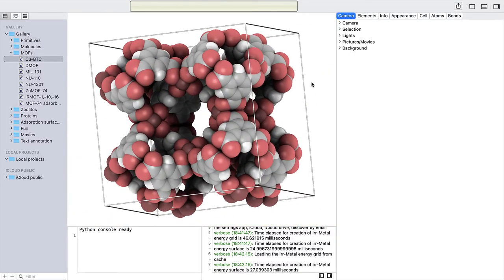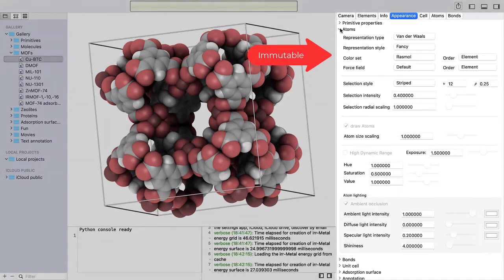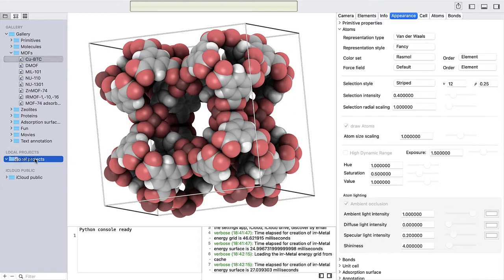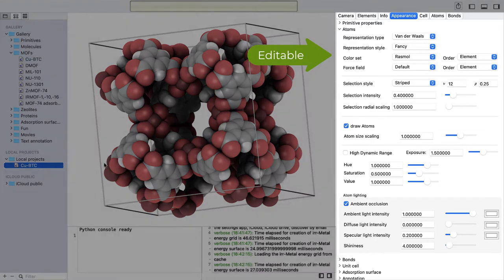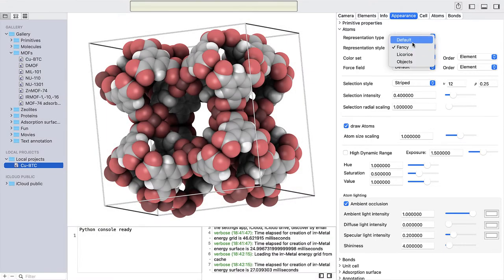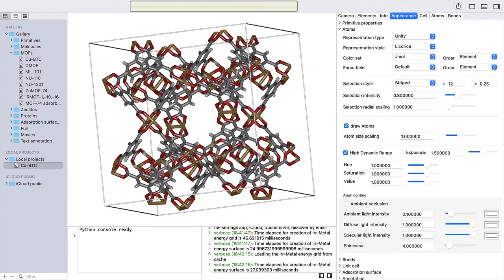The pre-made Gallery and iCloud sections are immutable. Drag and drop the structure to the Local Projects section. The projects in the Local Projects are mutable and the copied version is editable. For example, go to Appearance, Atoms, and change the representation style.